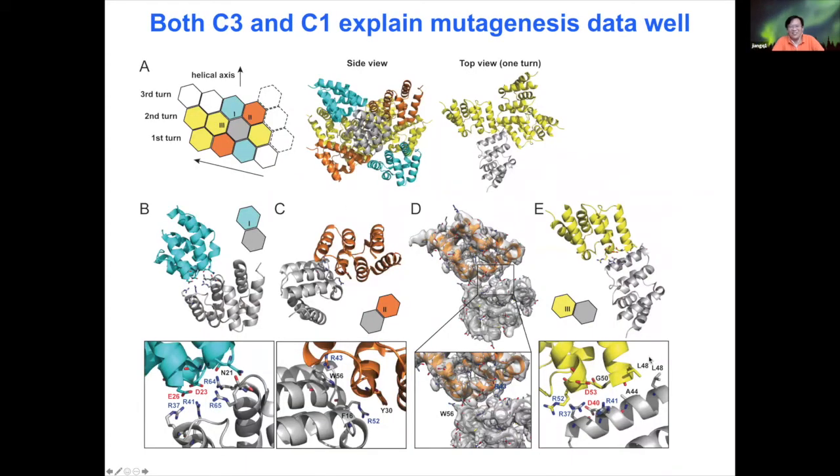No, it's not. This is a very good question, because we actually worried about this as well. I mentioned during the talk that the chemical group, the nickel NTA, is about 20 angstroms away from the surface, and the linker in between is quite flexible, such that the orientational change of the molecules is still fairly random.